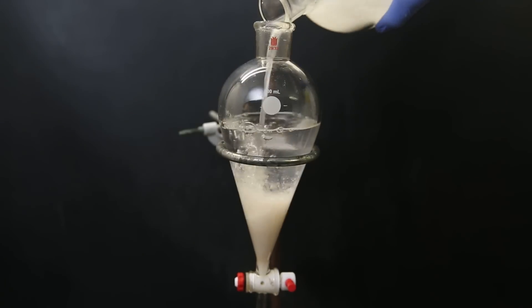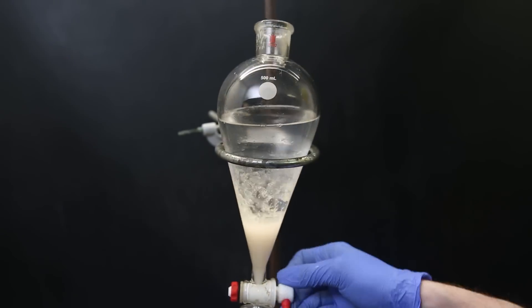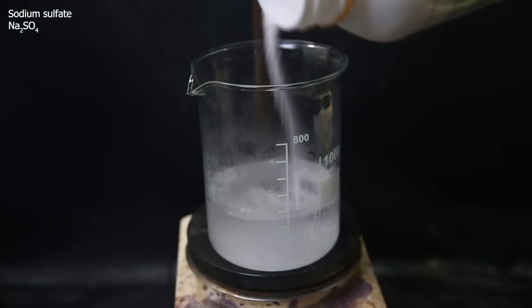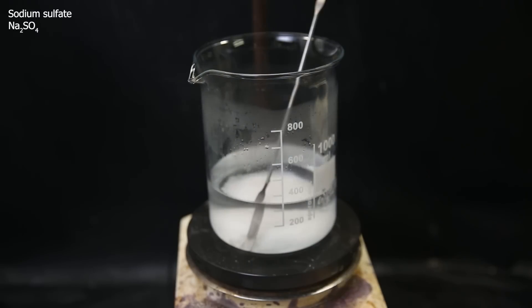I move this mixture to a separatory funnel and drain off most of the water layer and discard it. I collect the 1,3-dioxalane in a beaker, to which I add some sodium sulfate, which will absorb remaining droplets of water.